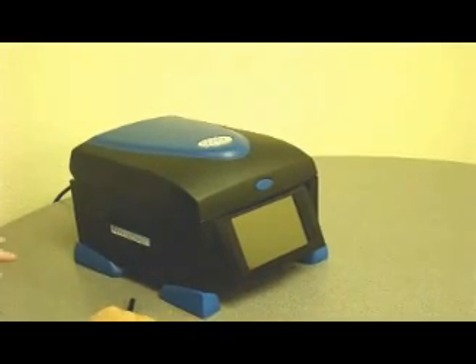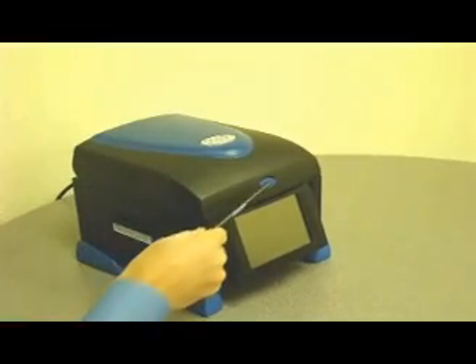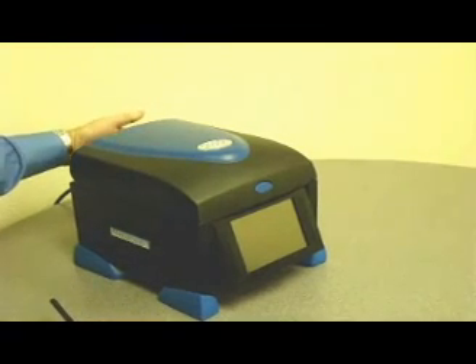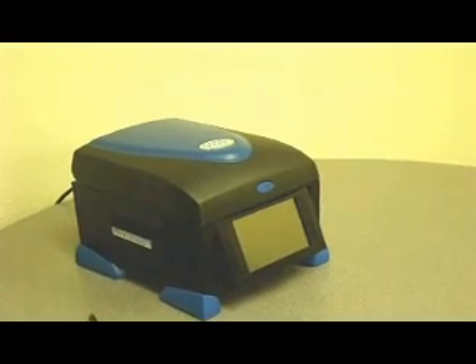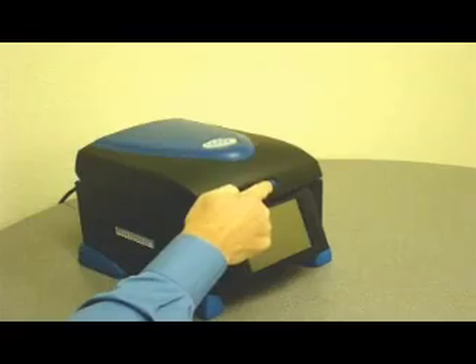You'll notice the clean design to the chassis. There's only one button on the front of this machine. The power switch is located in the back of the machine to prevent accidental shutoff during an experiment.